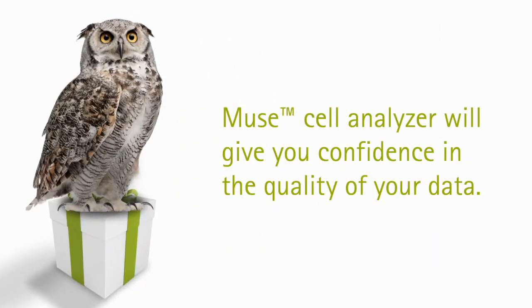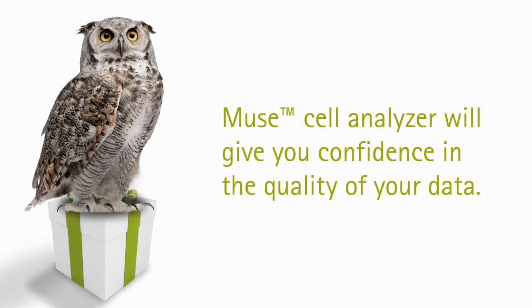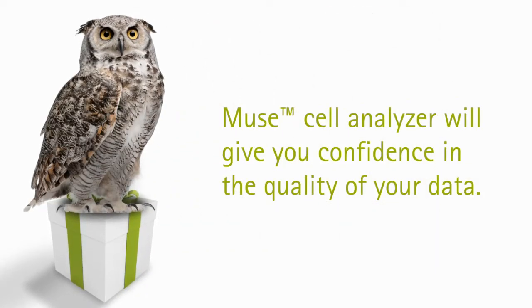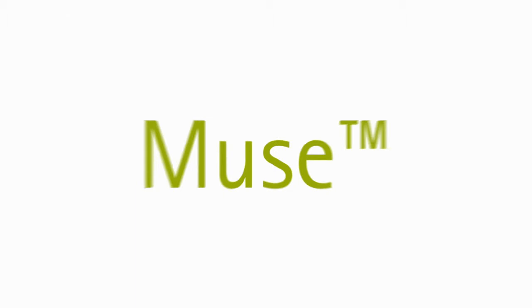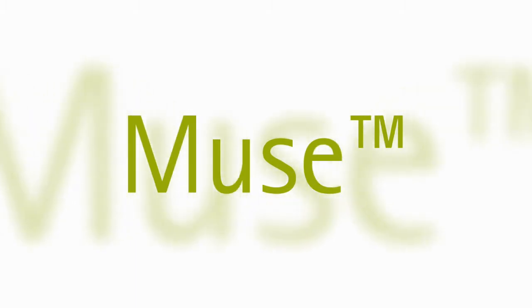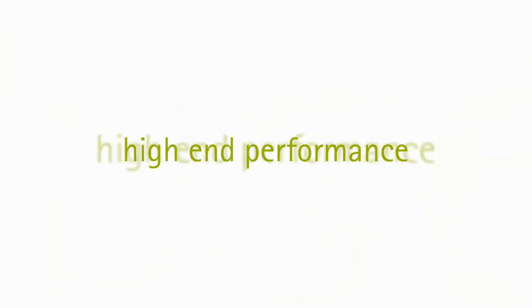The Muse Cell Analyzer will give you confidence in the quality of your data, bringing high-end performance to detect up to three cellular parameters quantitatively.